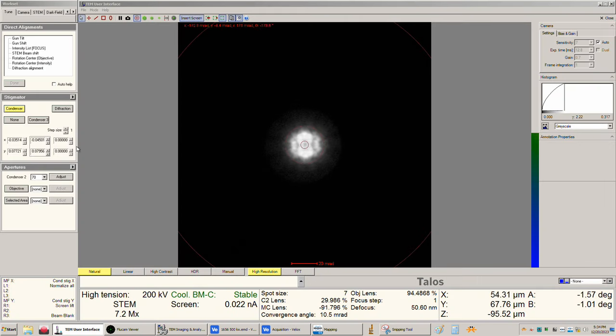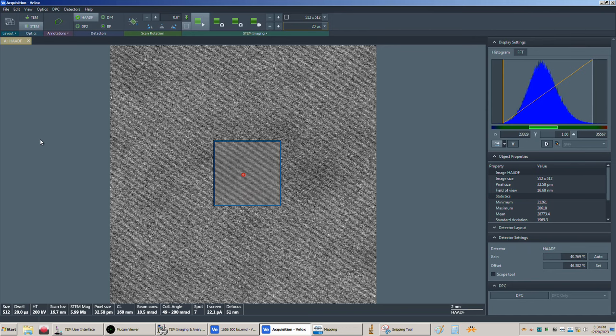Let me come back here. Copy 2 to 3. Okay. All right. So if I go back here just to mess with this, I can retain those values here. I can't stigmate this out. That's very, very odd. Yeah, see right about there, that gets really sharp. Right about there, that also gets really sharp.